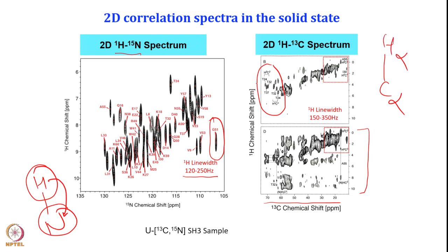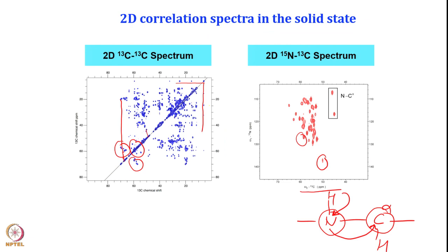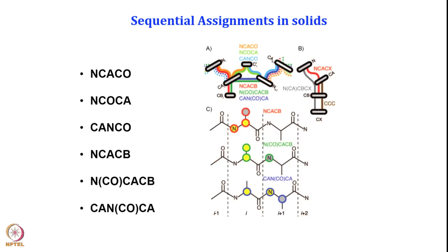So, here even though proton is in the indirect dimension, because the dipolar coupling could not be averaged out, we are really getting a broad spectrum, and therefore faster and faster speeds are required, and lots of technological development is happening in this direction. But at a moderate speed, heteronuclear detections and heteronuclear correlations are of quite benefit. Here we are almost getting liquid-like spectral resolution using PDSD, and using the NCA experiment, we can essentially get the resonance assignment.